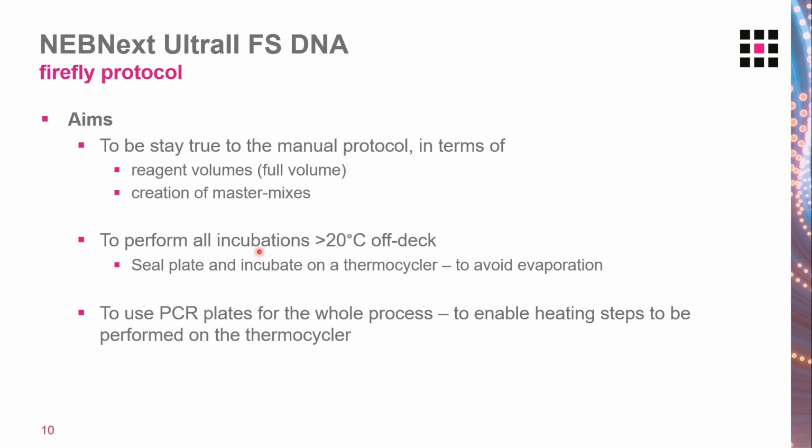So when running our protocol, our initial aims were to stay true to our manual protocol, the NEBNext Ultra II FS DNA manual protocol, in terms of volumes and master mixes. And we wanted to perform all incubations greater than 20 degrees C off the deck. This was to avoid any evaporation issues causing problems with volumes.